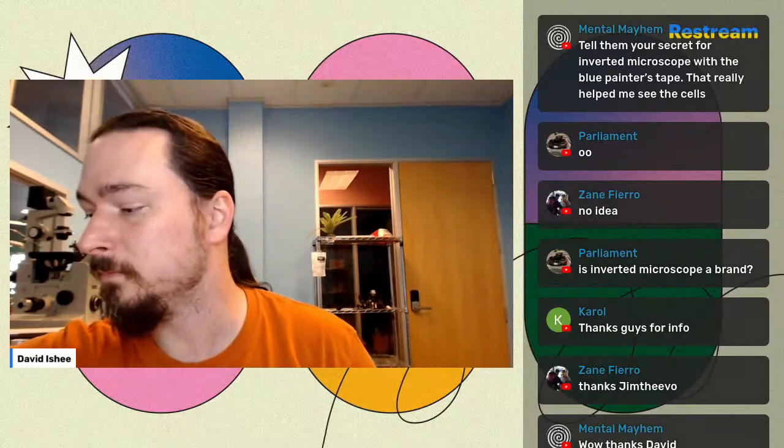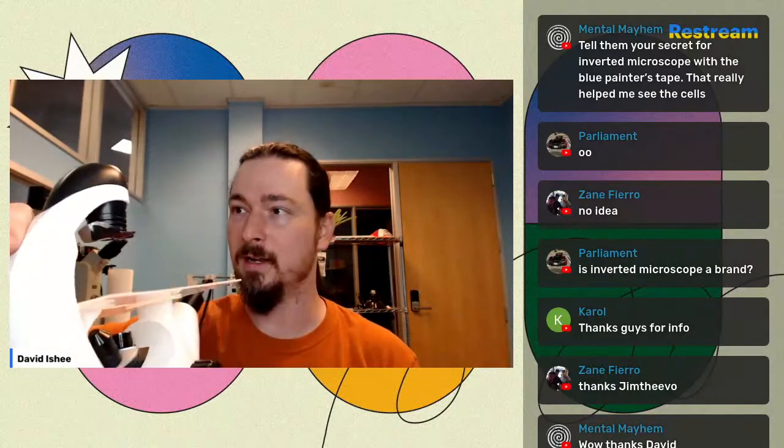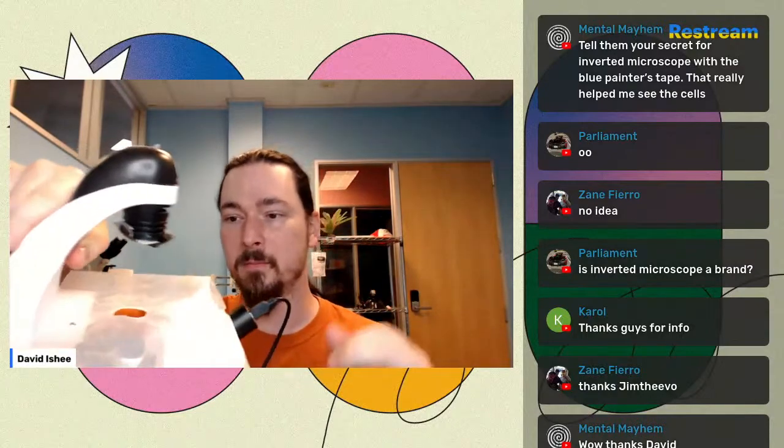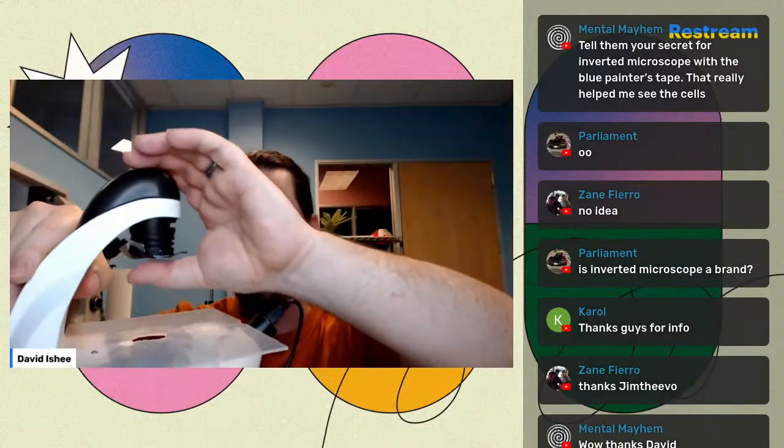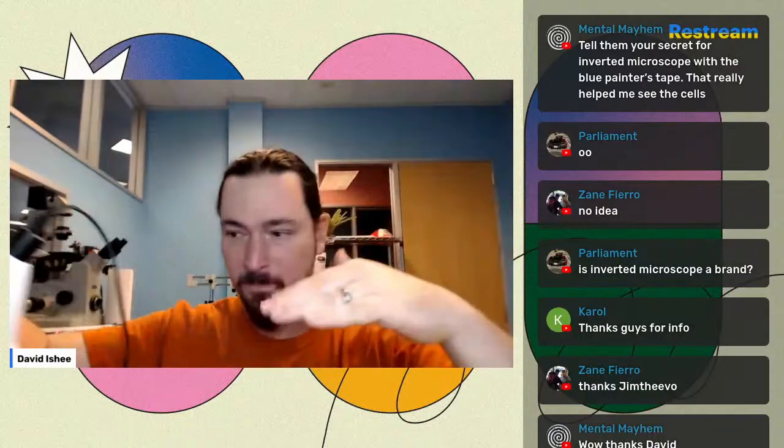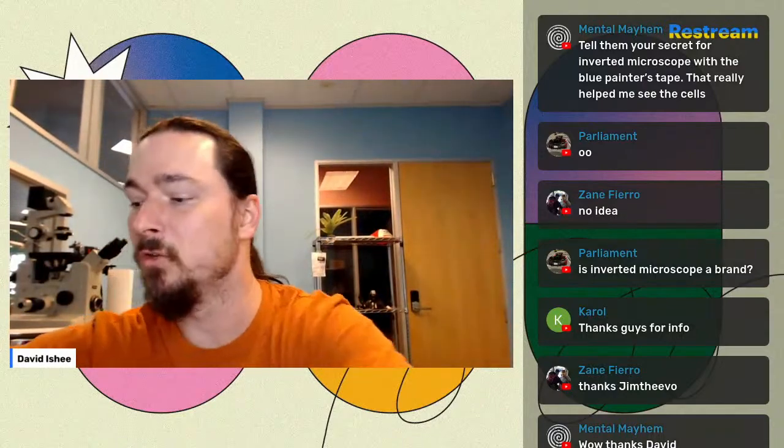Tell me your secret for inverted microscope, blue painter's tape. Honestly, so that is one thing. This is more of the human cell class stuff. But here's my heavily abused inverted microscope. This one's broken. If you cover part of the light source, you can create sort of a drop shadow embossed effect, and it makes a lot of the three-dimensional shape of the things on the plate much easier to see than just full light.